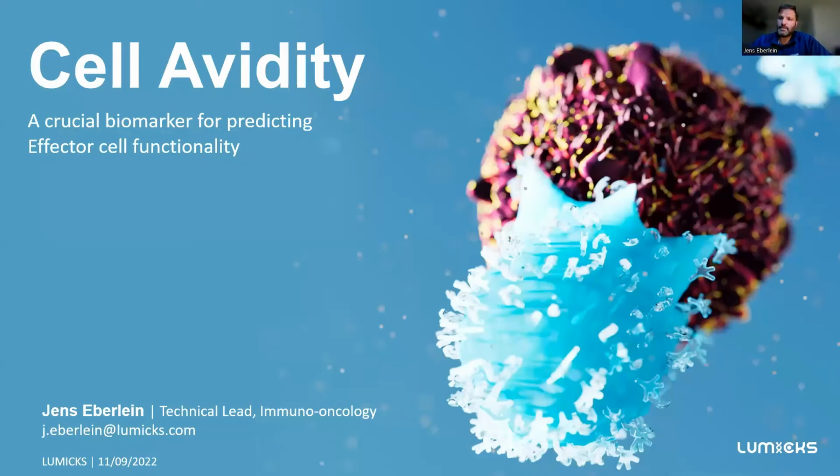Okay, so then let's move on. Thanks everyone for attending. My name is Jens Eberlein, and I'm the technical lead for the Cell Avidity part here at Lumicks. I would like to zoom out from the molecule level and shift the focus onto a different topic that is vital to the success of cell-based immunotherapies, and that is how we can measure engagement between an effector cell and a tumor cell.